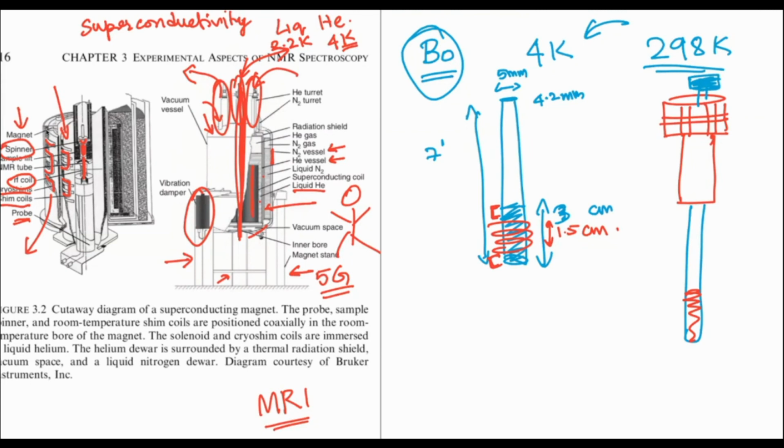So far, what we have seen is a block diagram of the NMR spectrometer and how the magnet looks. The magnet has different cryogens in order to ensure that the superconductivity is maintained at a low temperature. And the nitrogen is something which we fill every week. On the other hand, helium is something which we fill every three months or so.